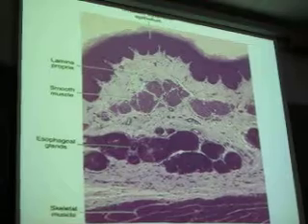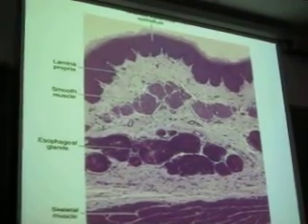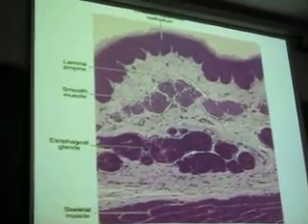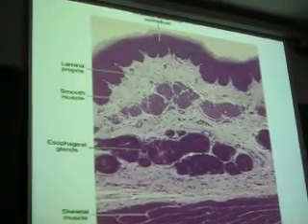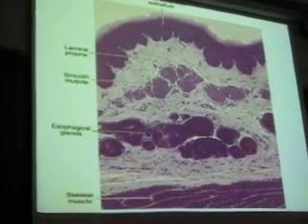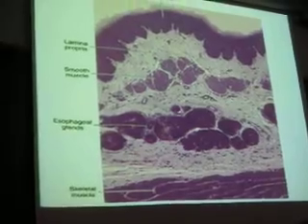What about the mucosa? What's special about the mucosa there? Not the esophagus. What's special about the epithelium of the mucosa? Oh, it's stratified squamous. Stratified squamous, absolutely. So that's the only place in the digestive tract, with the exception of the mouth, that we're going to find stratified squamous epithelial tissue. So a couple of things you guys need to look for.